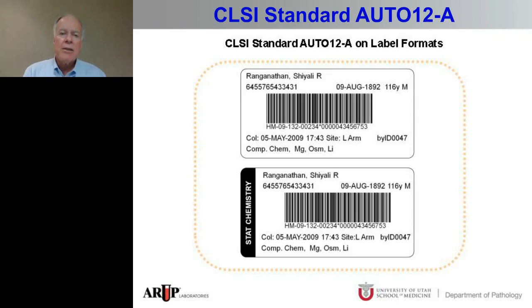As our committee reviewed a lot of different label formats, we found the patient name anywhere on the label, from first line, second line, third line, fourth line, fifth line, above the barcode, below the barcode, left justified, right justified, sometimes in the middle, and sometimes turned 90 degrees to the orientation of the rest of the label and the orientation of the tube.